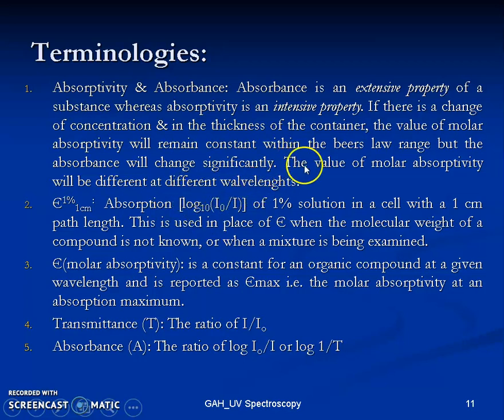What different concentrations? We have a range called the Beer's range. The Beer's range is nothing but this: once we prepare the samples in varying concentrations, the absorbance we get out of these concentrations should be from 0.2 to 0.8. If the absorbance is between 0.2 and 0.8, then the respective concentration we have, we call it the Beer's concentration.